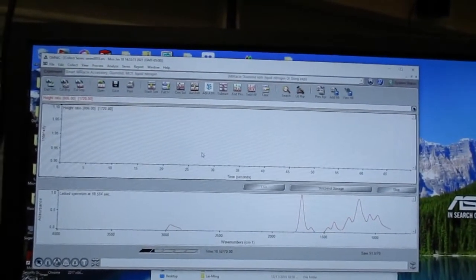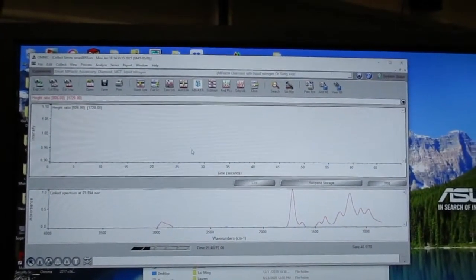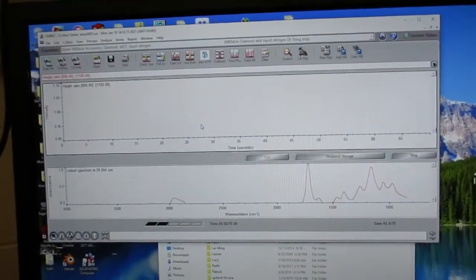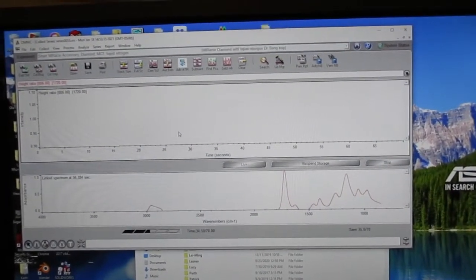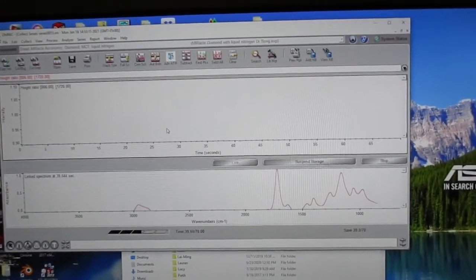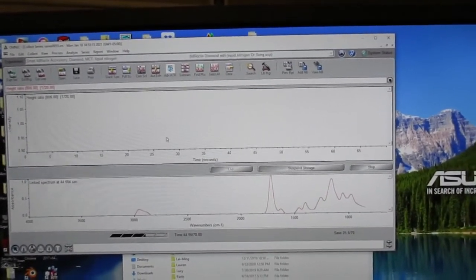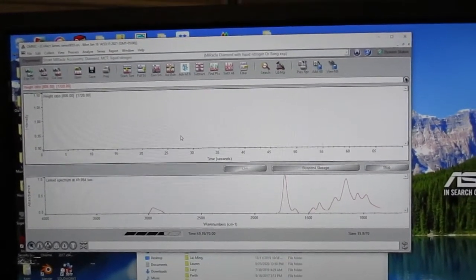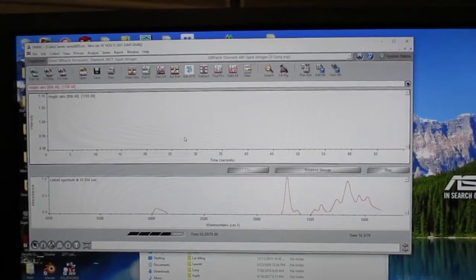We typically run our experiments over a minute, sometimes 2 minutes. And the IR is measuring vibrational bonds absorbance over real time.